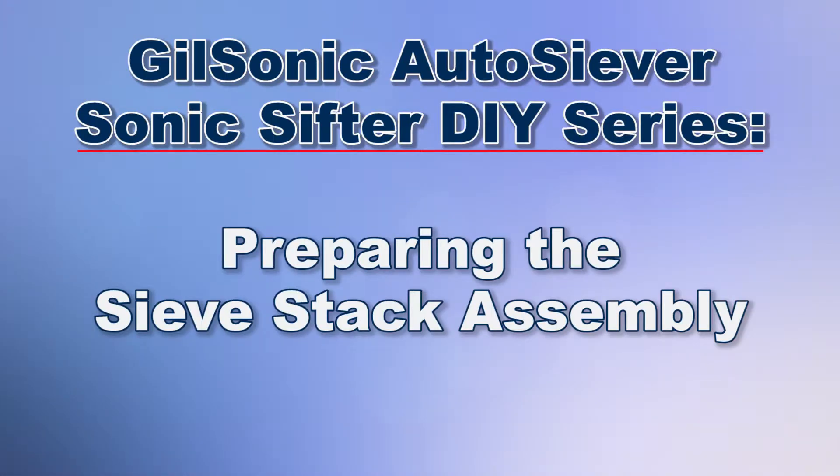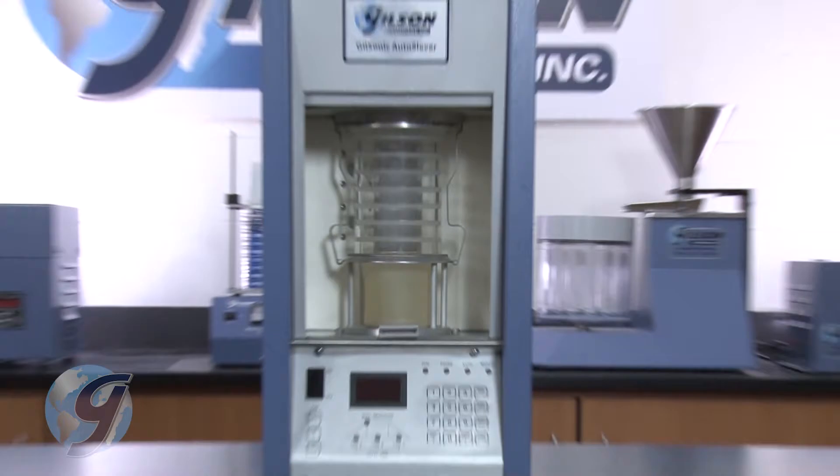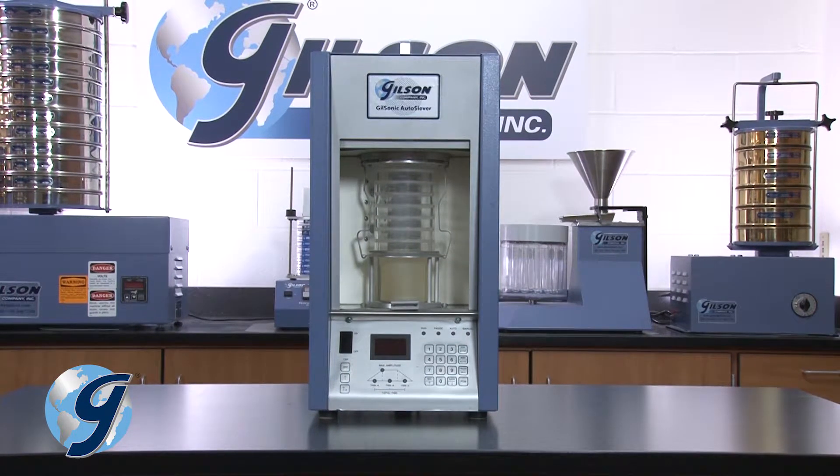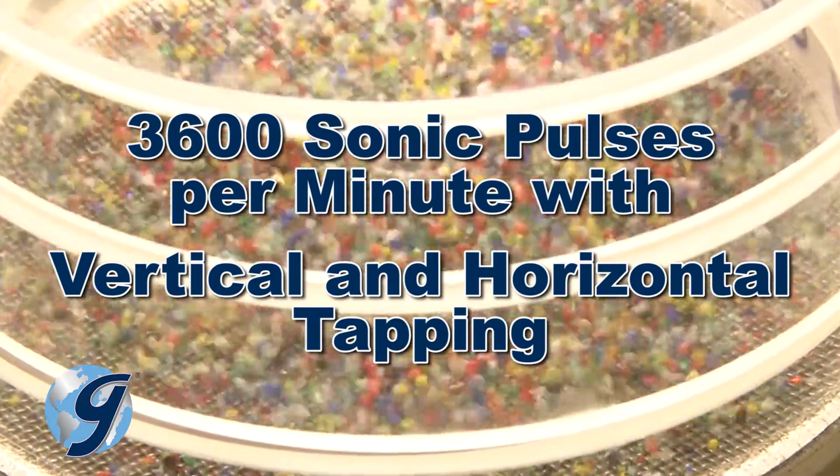Today we're going to demonstrate how to put together the sieve stack for the Gilson GA6 Gilsonic Auto Siever Sonic Sifter, which offers precise and dependable particle separations of fine granular materials and dry powders.